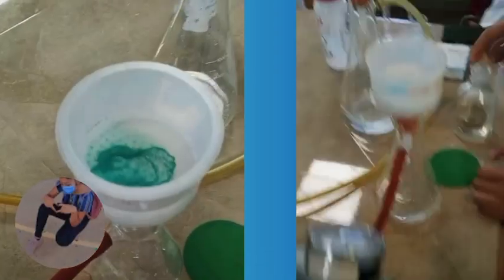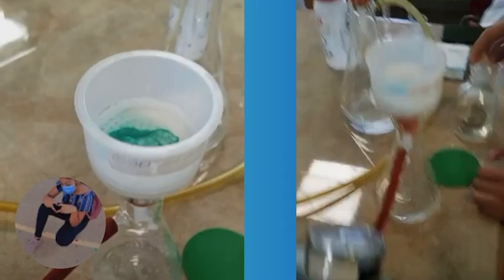If it's a clear or white filtrate, the excess would be sodium carbonate and the limiting would be copper 2 chloride. So the limiting reagent for the first trial is copper 2 chloride and the excess is sodium carbonate, and the limiting reagent for trial 2 is sodium carbonate and the excess reagent is copper 2 chloride.